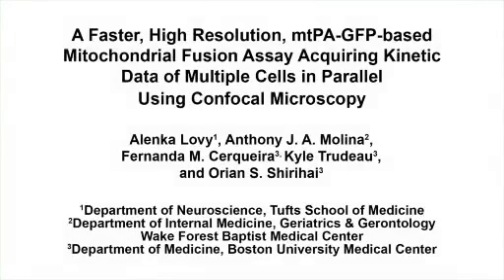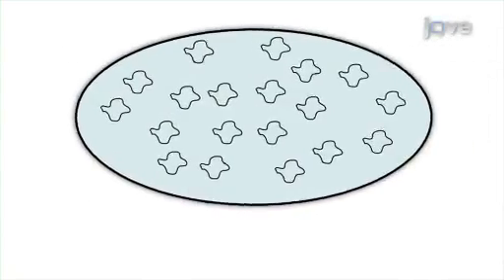The overall goal of the following experiment is to measure mitochondrial fusion in highly resolved 3D images of multiple cells in parallel. This is achieved by first expressing mitochondrial photoactivatable GFP in the cells of interest.